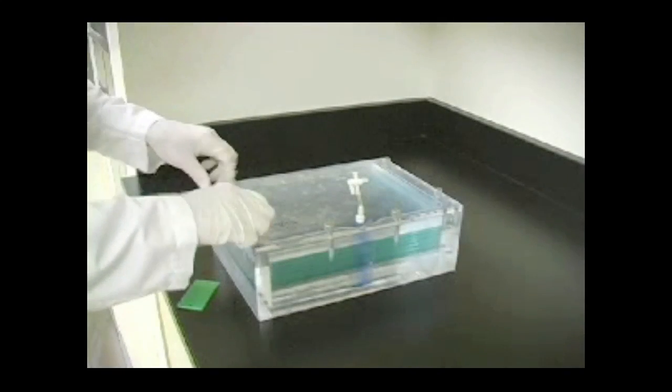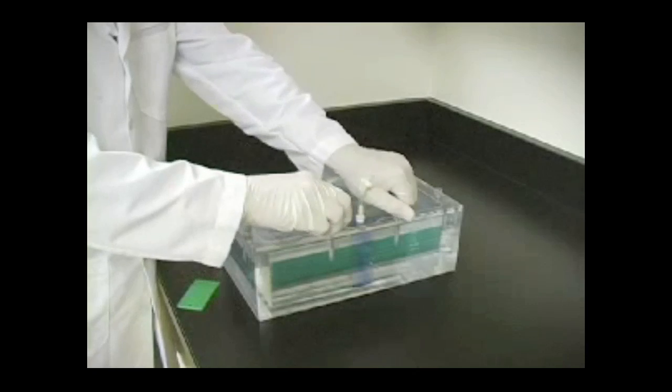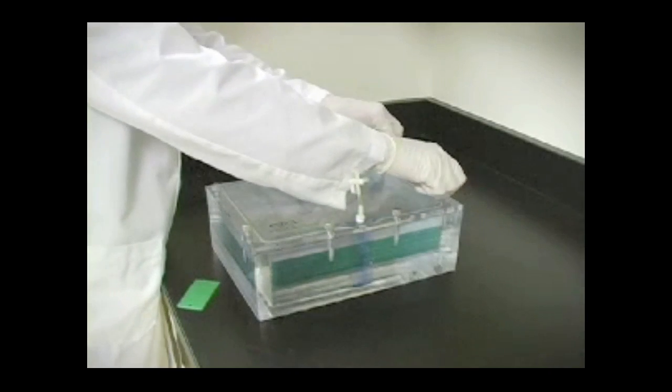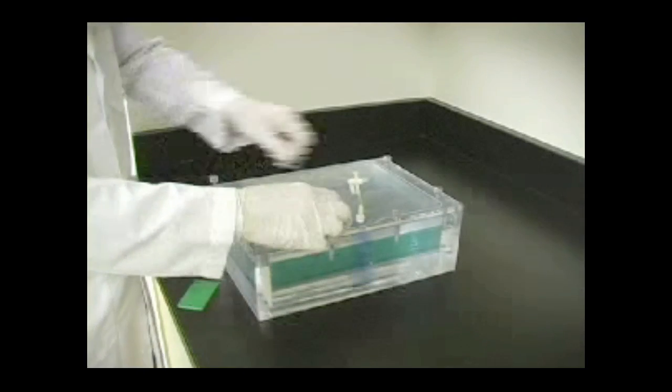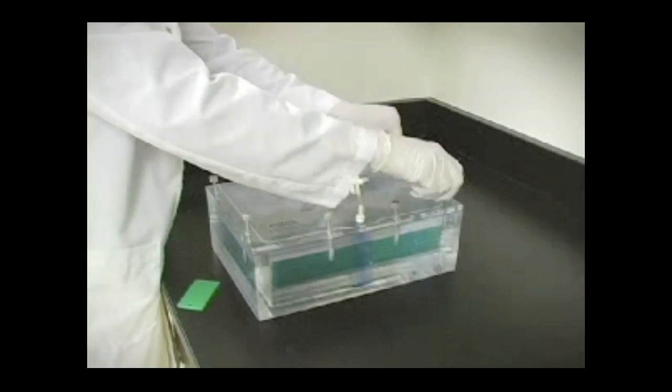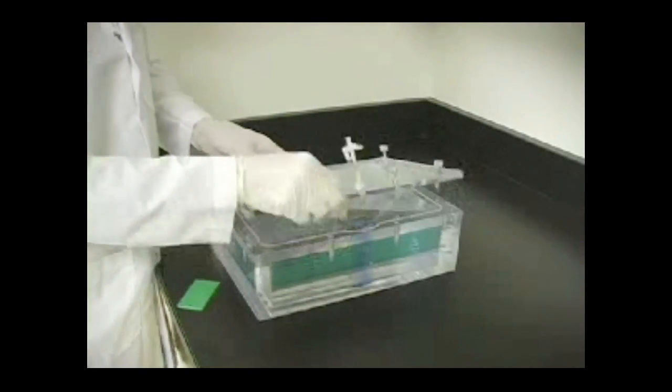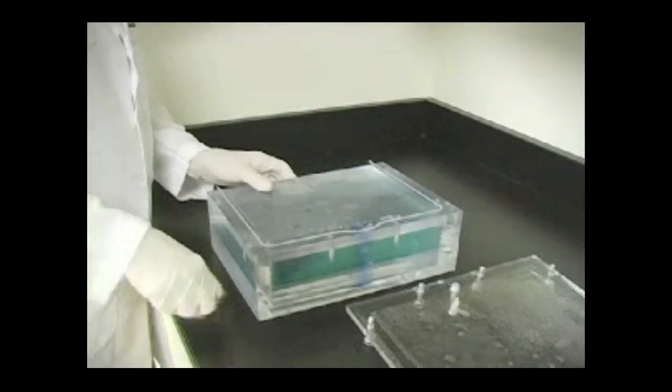After polymerization, remove the sealing plate from the multicasting chamber. Remove the gels from the stack one at a time using the green gel releaser.